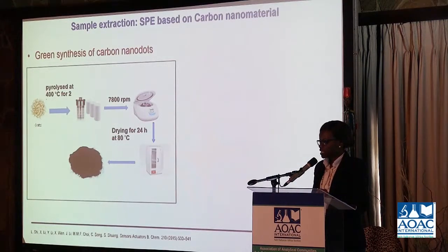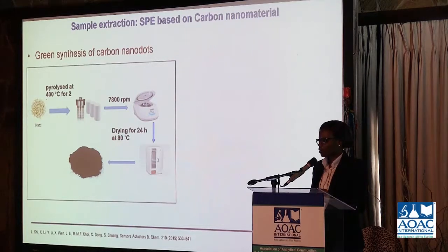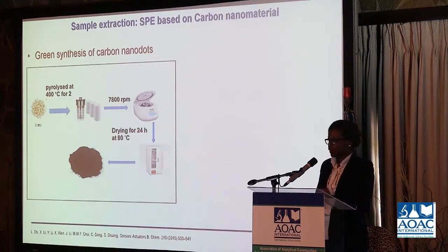For my solid phase extraction, this time around, I'm using carbon-based nanomaterials. I decided to do this because our university's applied chemistry department is a center for nanotechnology. So I decided to use carbon nanomaterials for my sample extraction procedure. For this work, we synthesized carbon nanodots from oats. For this procedure, you have 10 grams of oats blended finely, and then you put it in the crucible and pyrolyze it at 400 degrees Celsius for 2 hours in a muffle furnace.